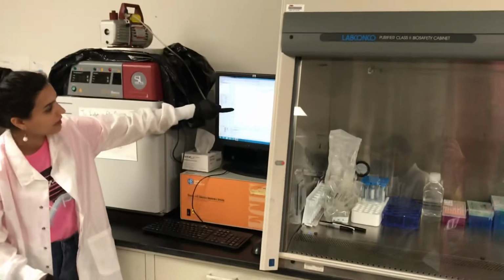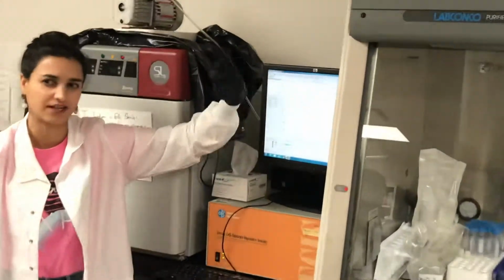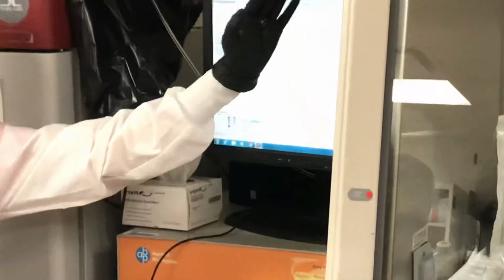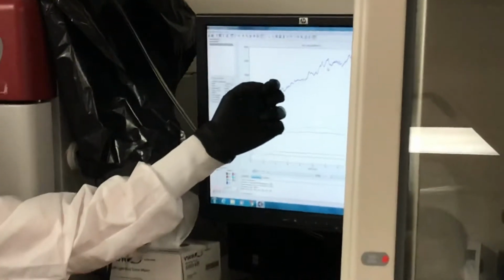This is results from 8 channels. It's saying that if it keeps going up, this is resistance, so it's like some sort of electrical readout. The more cells that get attached, the more this line goes up. So I can see how well this is going. I can say these wells don't have that good a cell attachment. This one is doing pretty well.